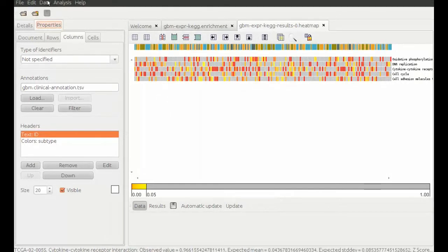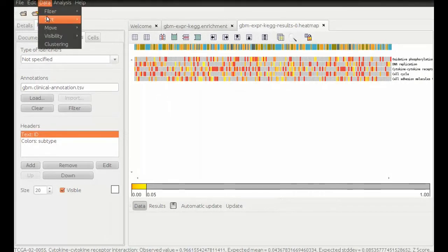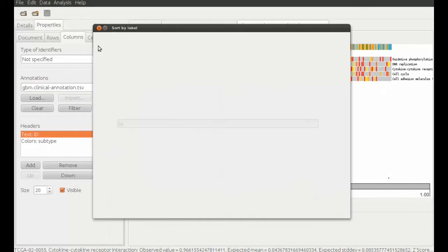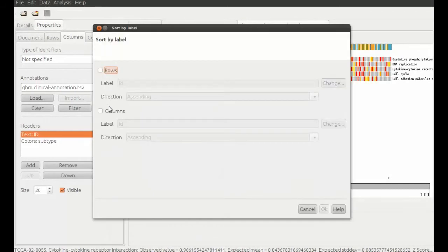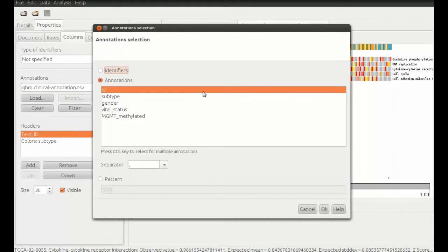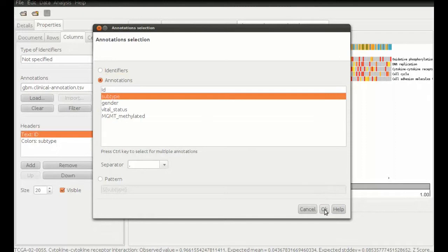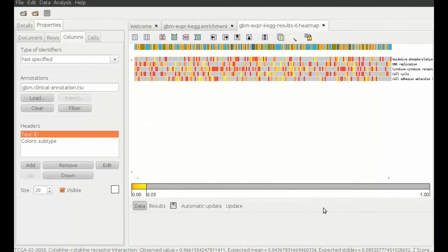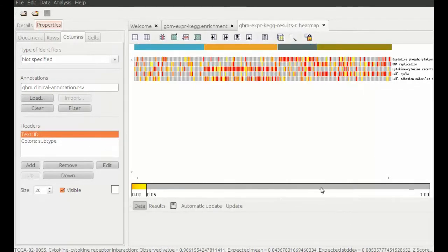Now we can sort the data according to glioblastoma subtype. Choose data, sort by label, sort columns by label, subtype. And suddenly we can see a much clearer pattern in the significance of the differentially expressed pathways.